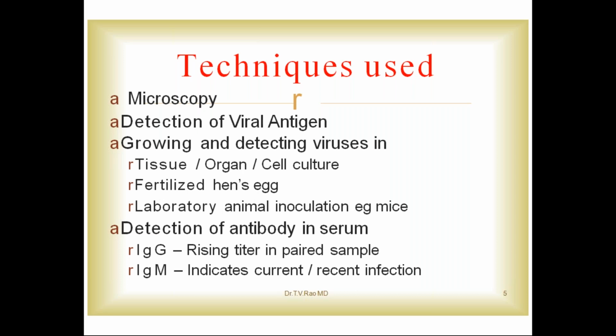Second one, in today's class, the fertilized hen's egg, the embryonated egg. The embryonated hen's egg is useful for the detection of the viruses. It is a living cell. The fertilized, embryonated hen's egg is a living cell.